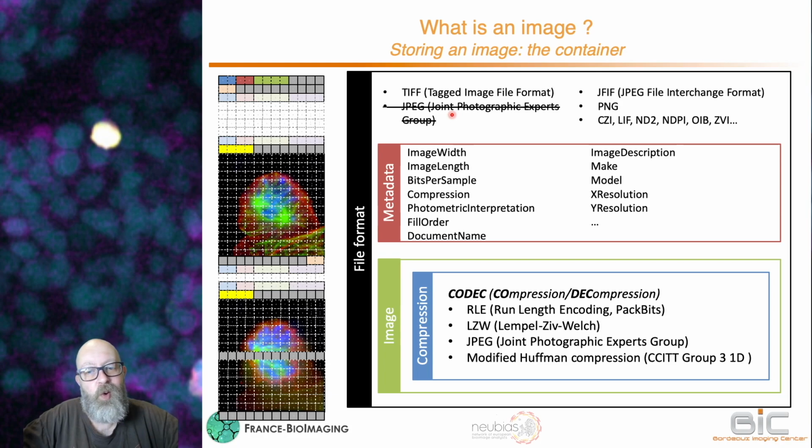They did it in a way that will impair the original signal that you collect from the detector, based on some limitations of the human eye. A JPEG picture will, how could I say, remove part of the details present on the image, so that it's easier then to compress and make it fit on a storage medium.